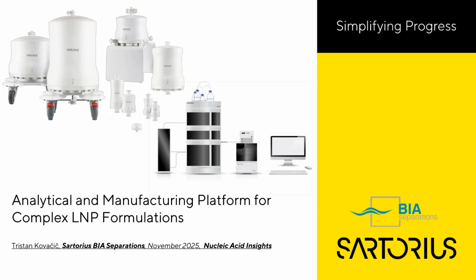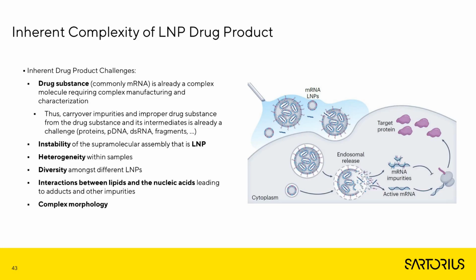Thank you, Rok, very much for brilliantly starting this story about the drug substance that we use in these novel nucleic acid type therapeutics, for vaccines, for CAR T therapies, or for other applications. So let me now go into the non-viral delivery of such drug substances. And first, I will spend a few minutes just talking about why we need to deal with our non-viral delivery vector in the way that I am suggesting here.